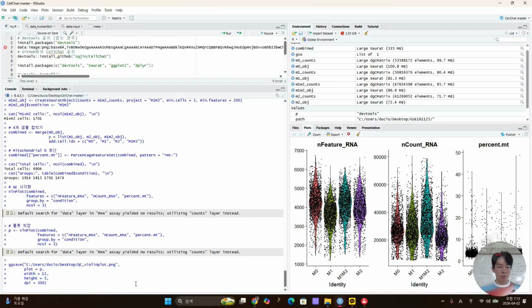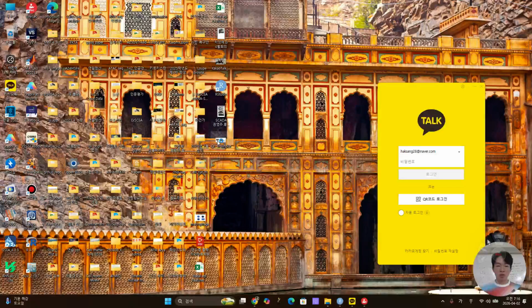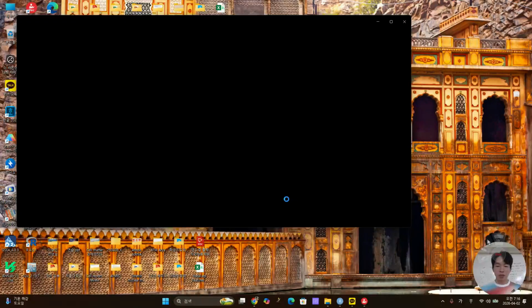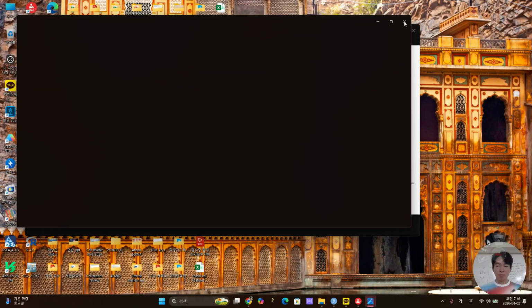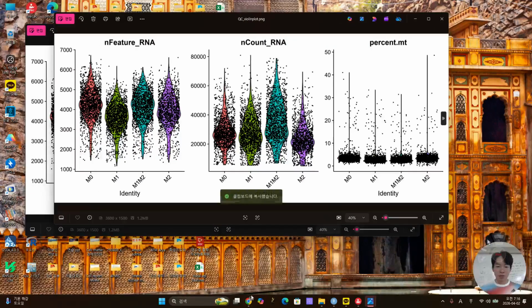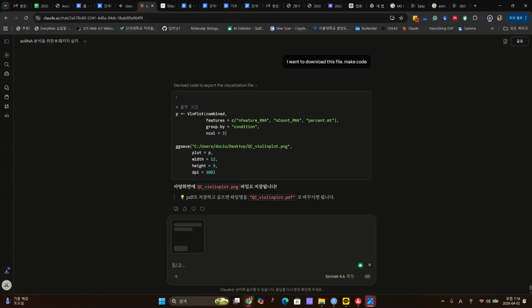When you look at this here, this is a PNG file. Here, this is the file you made. Why? Okay, right. And then copy this one, paste here. Let's proceed, analysis, analyze. Okay.